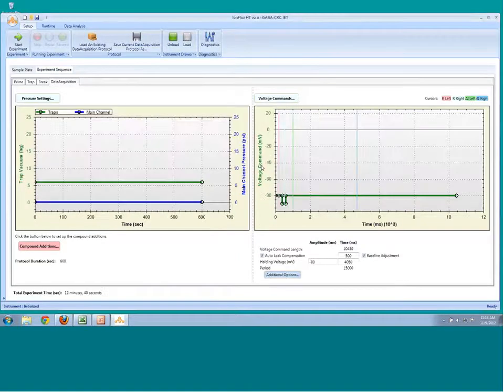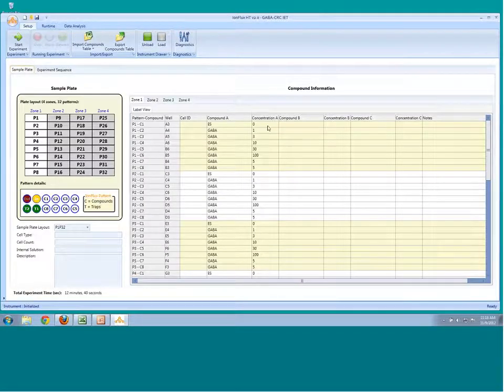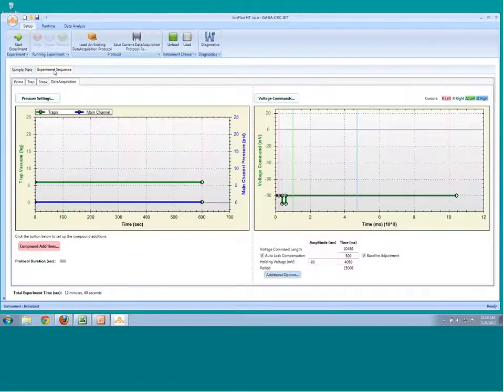So when I open that experiment, then my notes for the experiment are loaded into my note page. And if I save the particular set of notes, they would be highlighted here. This would be perhaps the next day, so I might want to edit this. Within the compound editor, we can change the names, but we can also simply choose to import from something that we've defined in Excel earlier. As well, we could choose to export this particular table, which we might want to do to have a template for editing the contents of this table. So we can simply import the updated table, if you will, for the day's run.